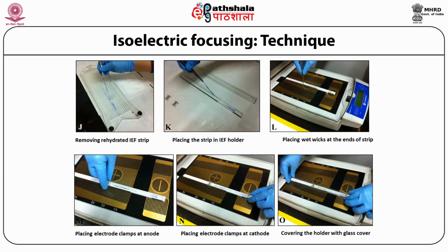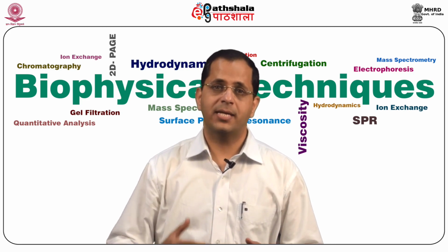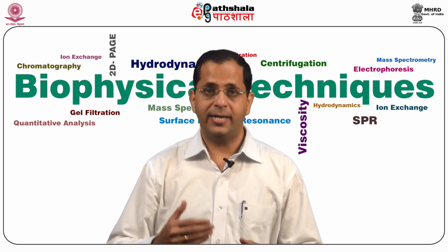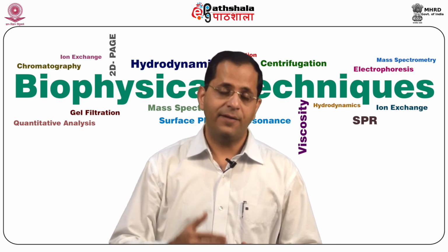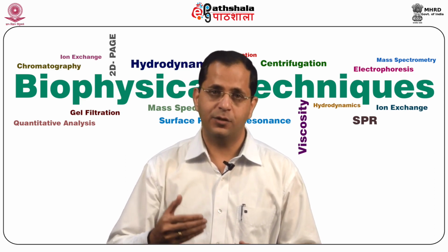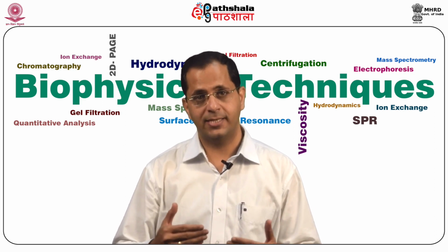Now let's talk about the step called equilibration. Equilibration is a very important and integral step that is done after the isoelectric focusing but before the two-dimensional electrophoresis. What is it that is done during this step?